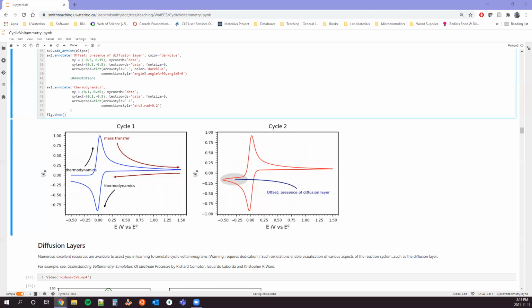A lot of it depends on the nature of the film. If you're in the situation where your entire film is electroactive and all you have to worry about is uniform diffusion passing through the film, it will act like a thin layer cell, where the time frame on which you need to probe it is dictated by the diffusion coefficient of the ions in that solid. If you have pores in the solution, that of course changes it. When you develop the models for this, you have to define the diffusion. Of course electron transfer can't happen without ion transfer, so the ions have to come into the material. By introducing pores, you facilitate transfer of ions into specific channels that then have to branch out into your material. So you have to develop a model for diffusion that factors that in. It does become more complex.